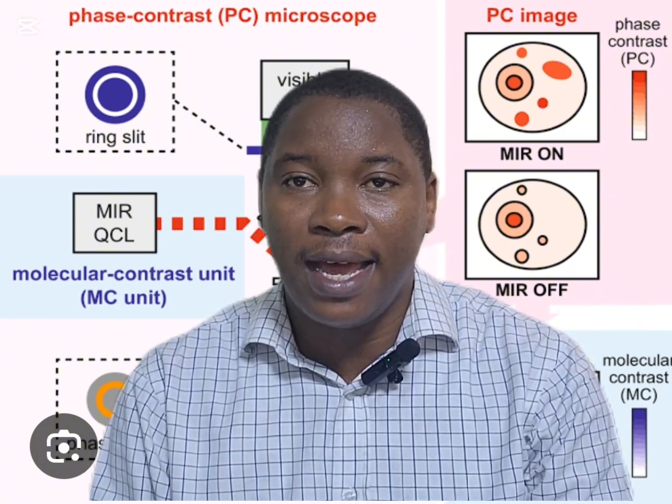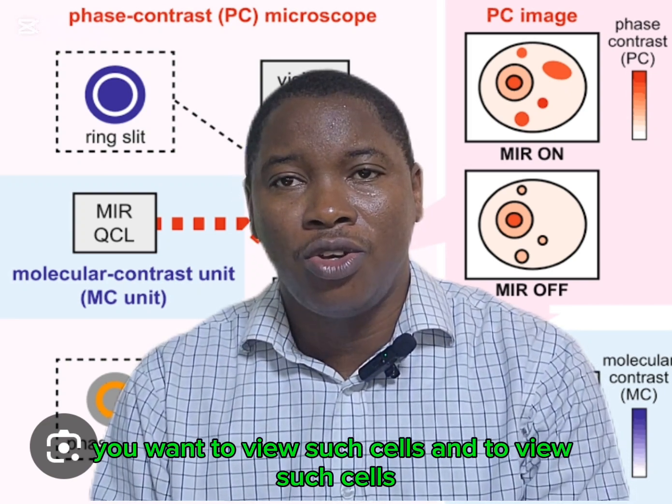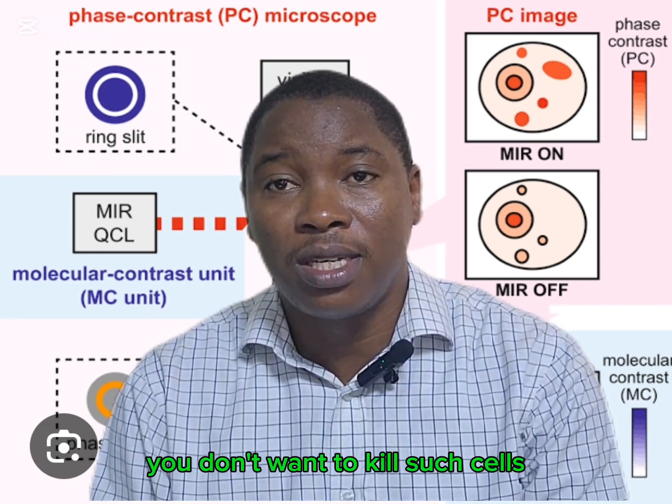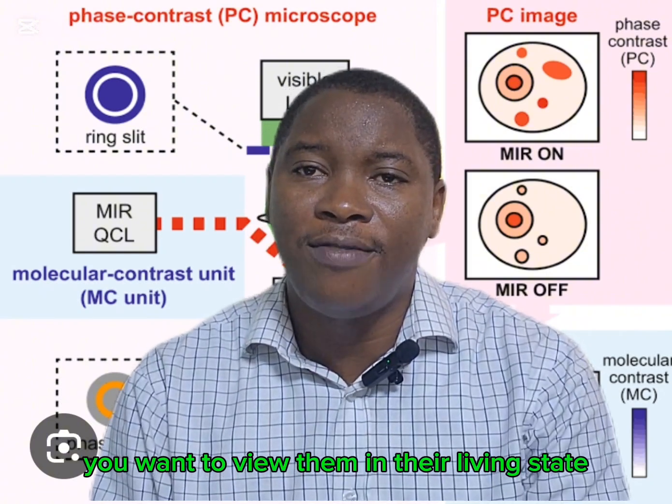fertilize an egg. So you want to view such cells, and to view such cells, you don't want to stain such cells. You don't want to kill such cells. You don't want to apply dye to such cells. You want to view them in their living state.